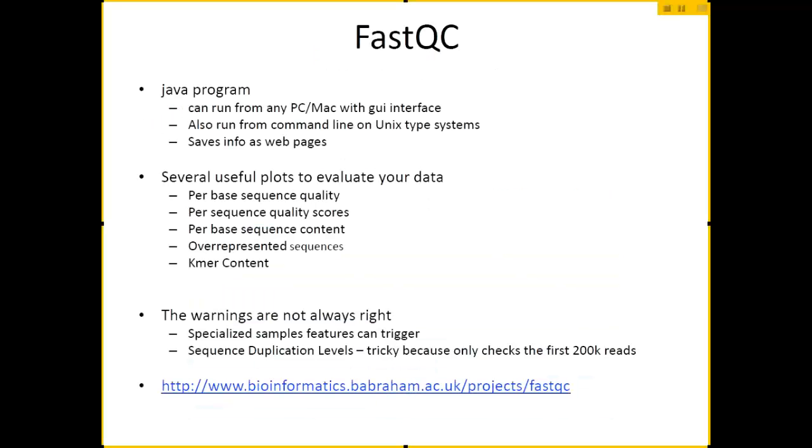Alright, now this is a program called FastQC. It's a Java program, so you can pretty much run it on any Mac or PC. You can just download it, double-click on it, and it has your standard interface. There's a file menu, you can open up a FASTQ file, it will read it in and give you some nice and interesting statistics.